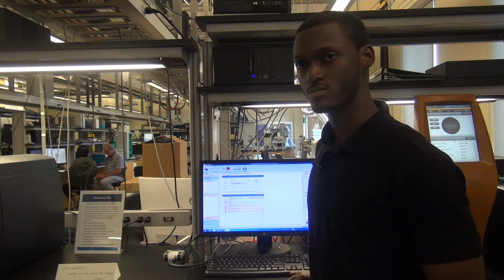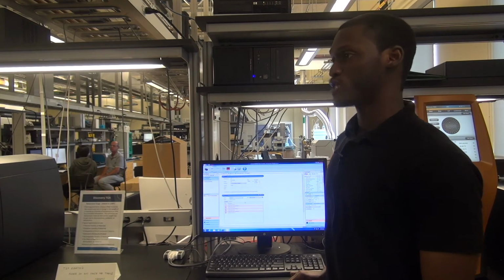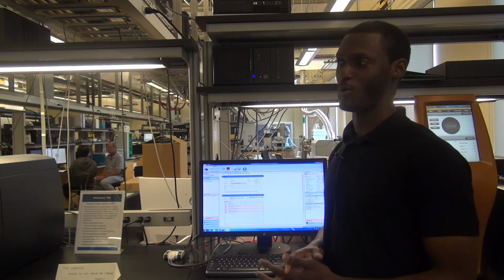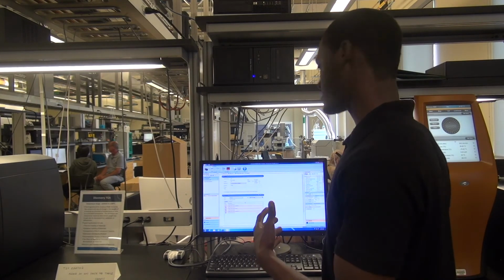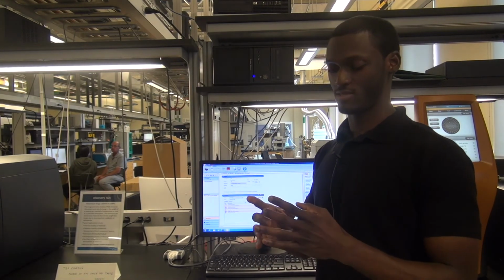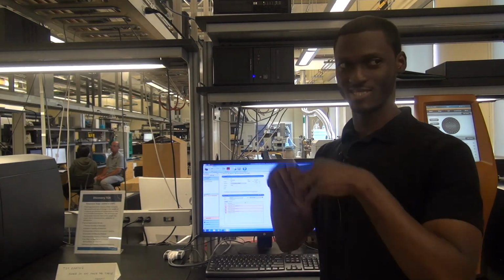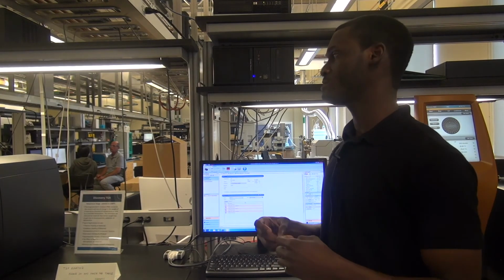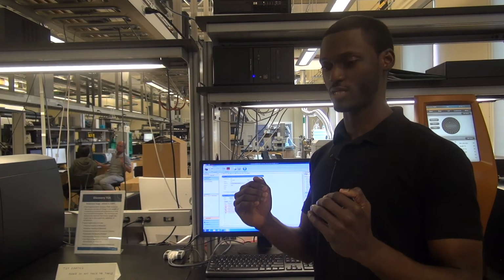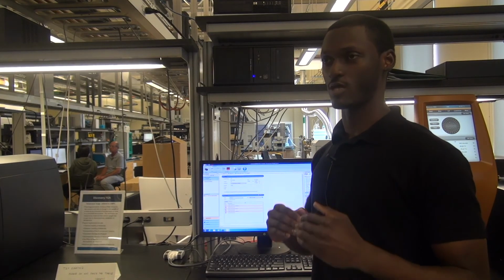So what's the meaning of changing the heating rate? So what essentially happens in that furnace? The entire block, that entire silver block, is heating up. So everything inside of that block is heating up. Okay. Now, if I heat it really, really slowly, then everything heats up essentially at the same time.